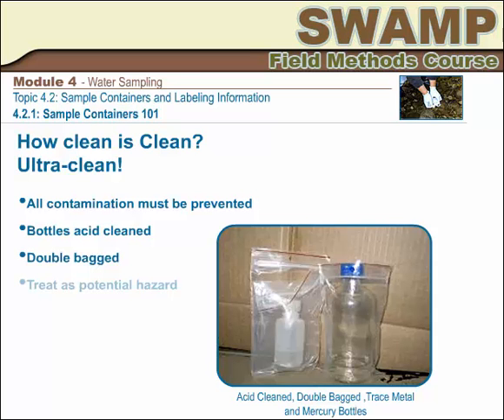When emptied in the field, the acid storage solution should be discarded into a waste container. Please see more health and safety instructions in subtopic 4.2.3.